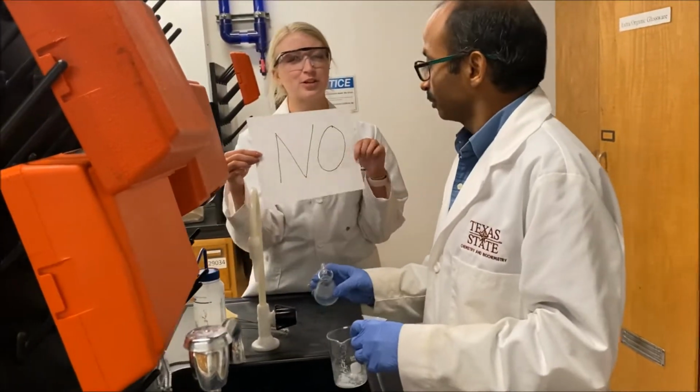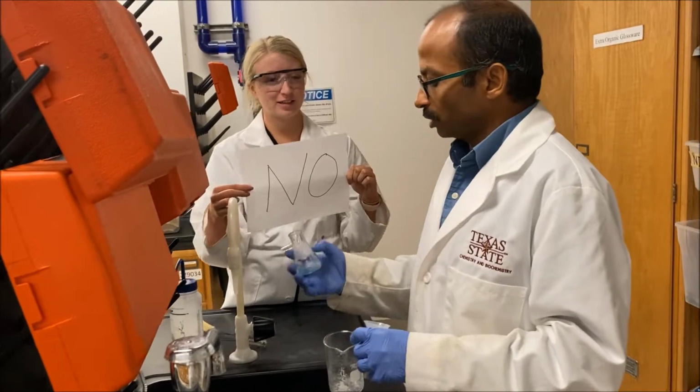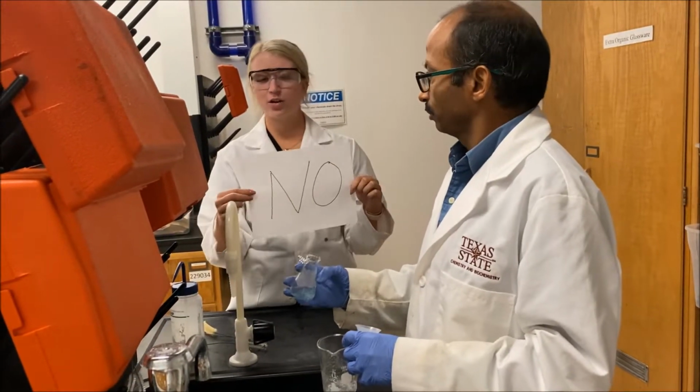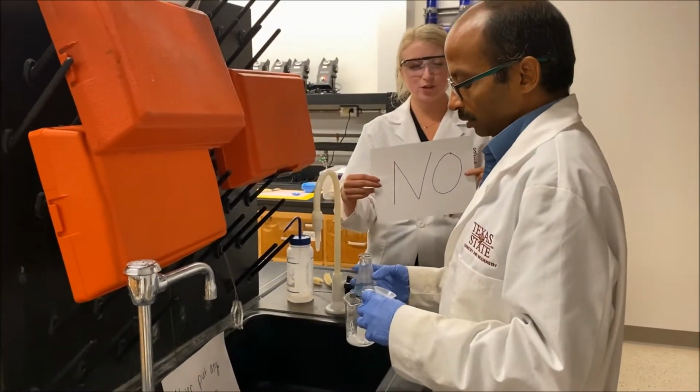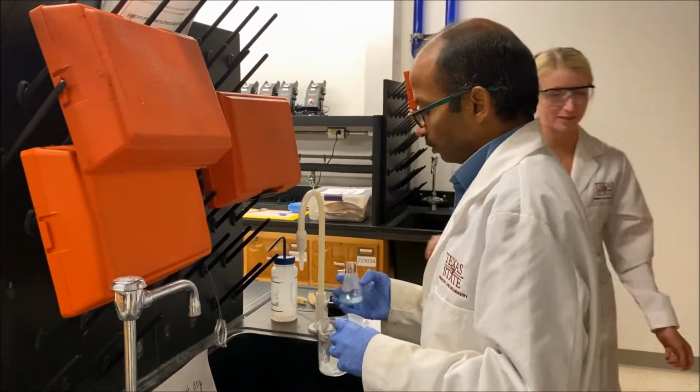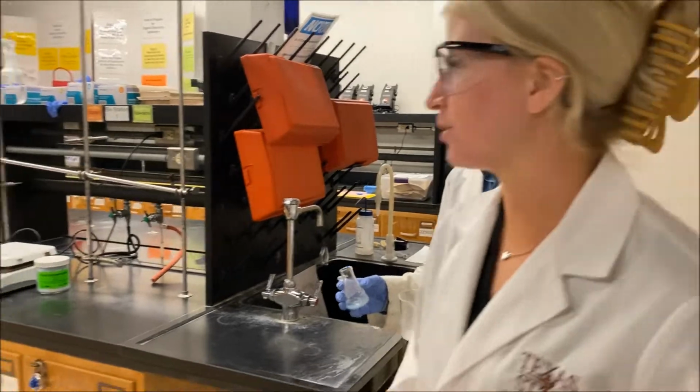No, absolutely no waste goes down the sink. Oh, this is water, aqueous waste only. No waste goes down the sink, only soap and water. Only soap and water? Let me show you where to properly dispose of those. Okay, yes, please. Come down this way.